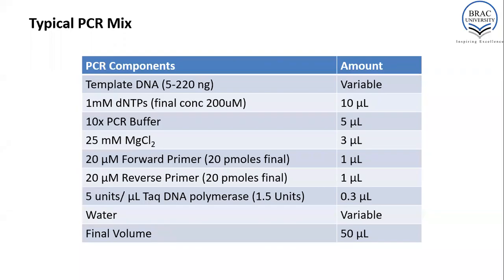So this is again a typical PCR mixture. What are the components you need to do a PCR experiment? It's normally the DNA template, and it depends on which organism you are using to do a PCR. If you use a plasmid DNA for a PCR, 1 picogram might be more than enough to do a PCR experiment, provided that the extracted plasmid has a good concentration.